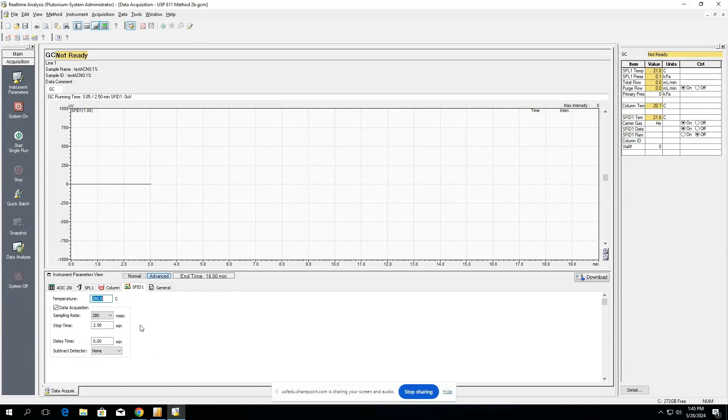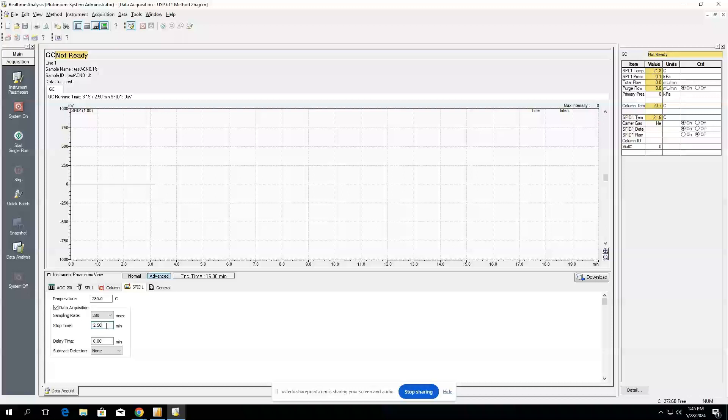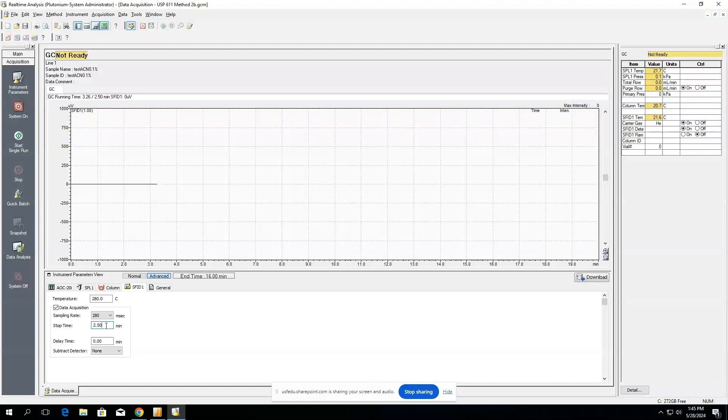If we look at our detector, we can look at all of the different parameters. This is how long it's going to run each injection before stopping the injection. So typically this is going to be however long it takes for the last analyte to elude, and you want to multiply that value by 2 just in case there's any impurities or anything that might elude late so you don't miss that elude.